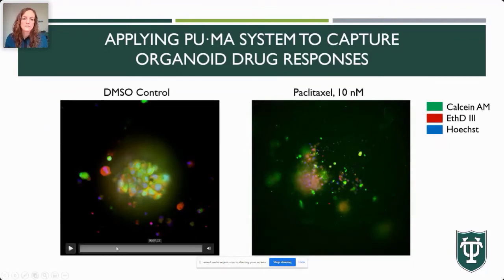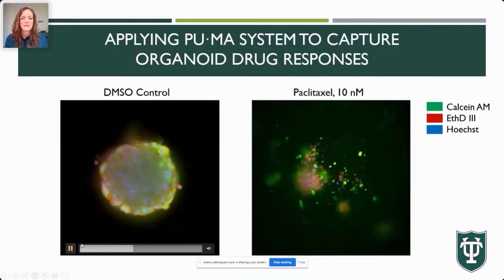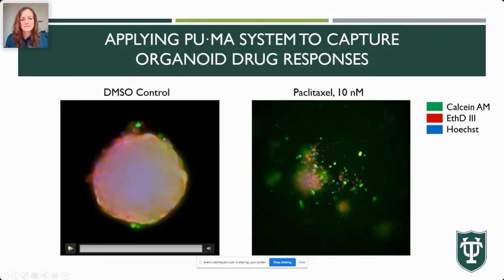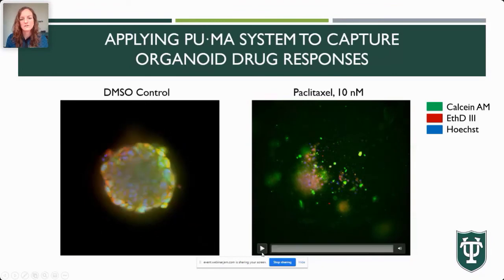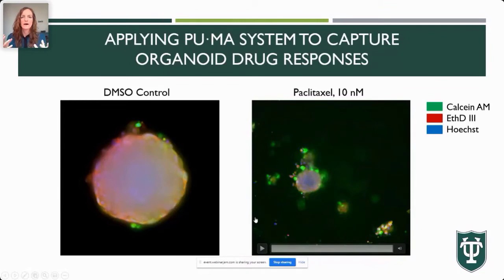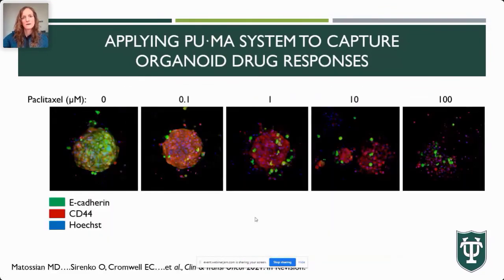These are videos. I'm not sure if they'll play, but we'll try anyway. But they're able to capture the depth of these organoids, and you can really see changes from drugs on a cellular level within the tumor and in the outer cells of the tumor. So really amazing images.